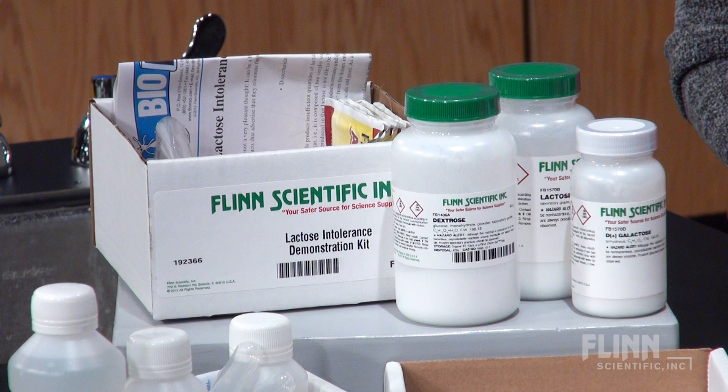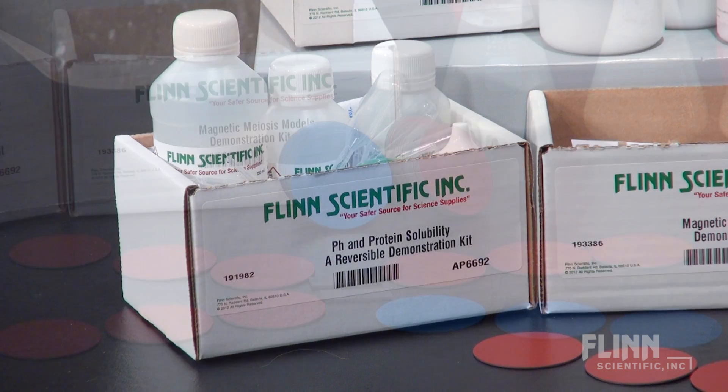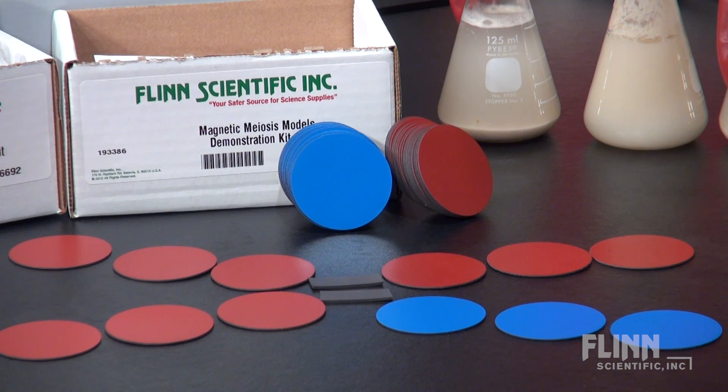Here at Flynn we realize how precious time is to each member of your department. No more searching for and preparing solutions. Get that valuable time back with ready-to-go demonstration kits.